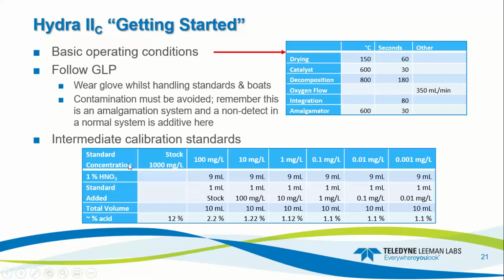And I start with 1% here, and then I keep the 1% all the way across. So it's additive from my original acid, which was actually 12% right here listed. So that's why these lower as you go. So you need at least 1%. I don't like to keep anything higher than that or less than that in the standards to preserve them.